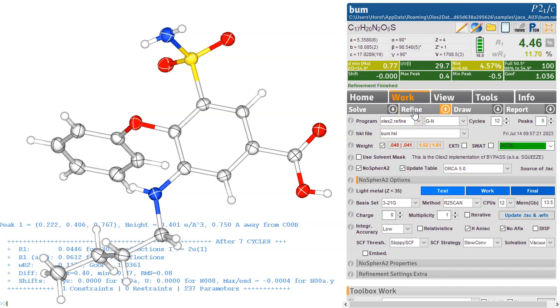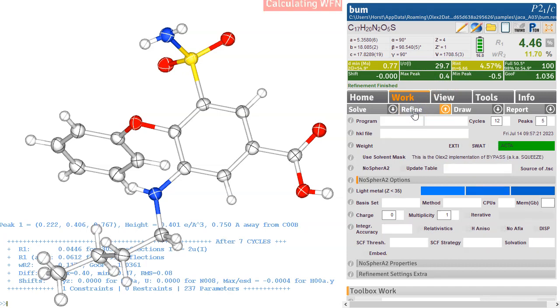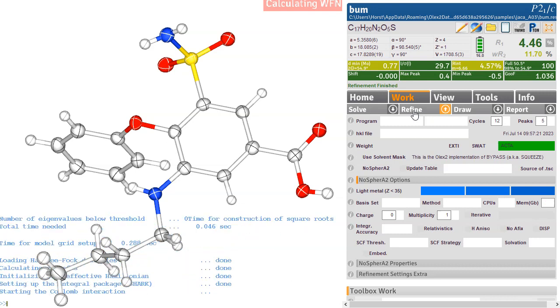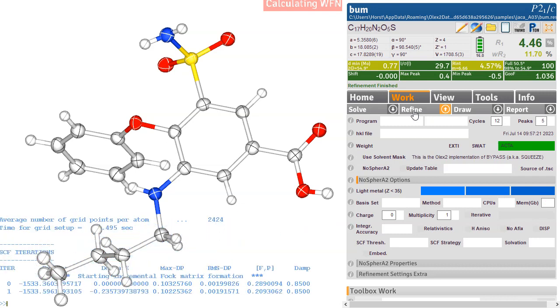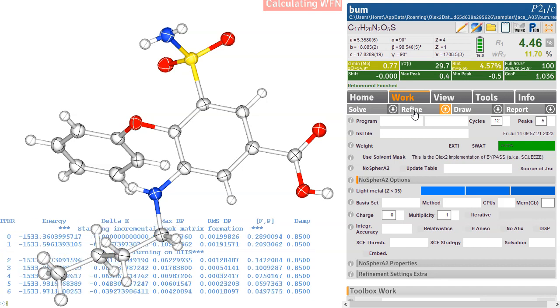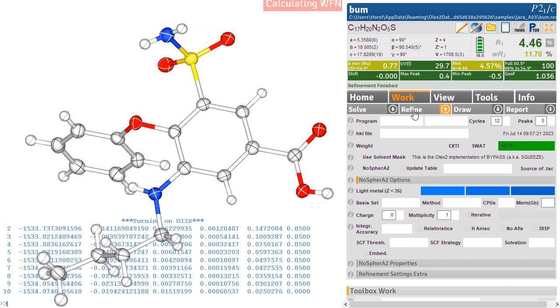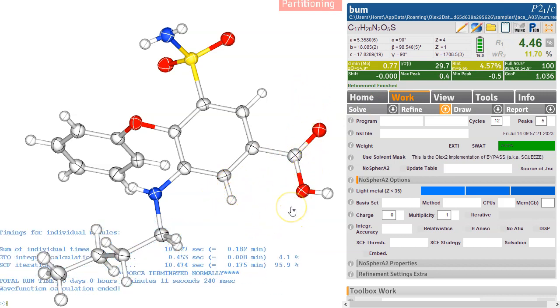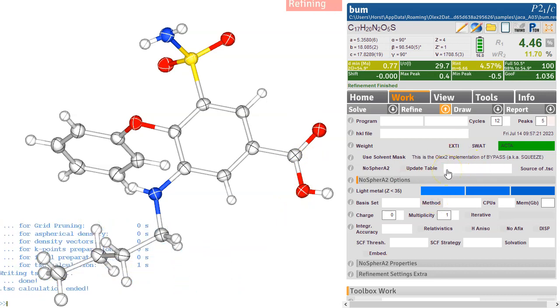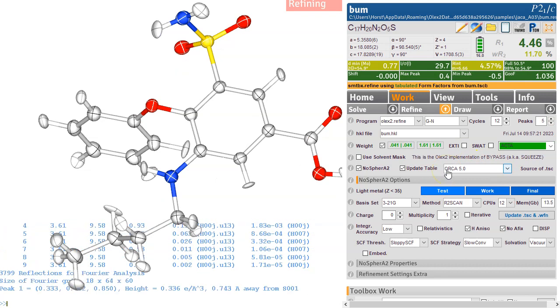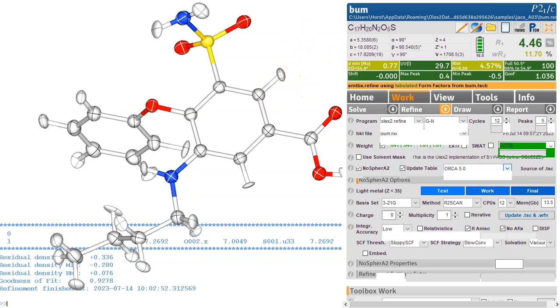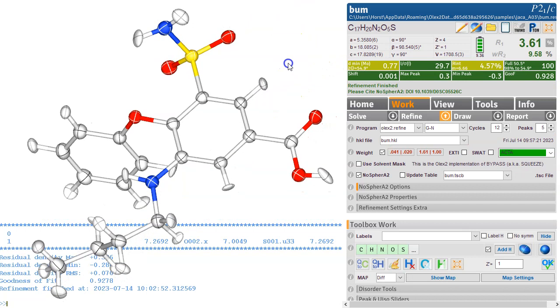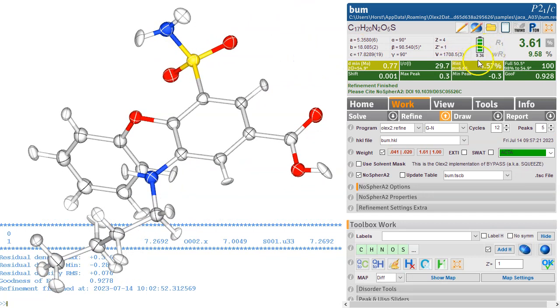So this is now calculating the form factors based on this structure. So you don't use tabulated form factors. It's not as fast, it takes some time. And if you do a really expensive calculation, it can take a little longer. You notice that these hydrogen atoms have become anisotropically refined, because we can do that, you don't have to do that. But the default is there's a tick box here, which you need to untick if you don't want that to happen. But as you can see, the hydrogens refine quite reasonably. Anisotropically, the data to parameter ratio is still reasonably full, nine to one data parameter ratio.